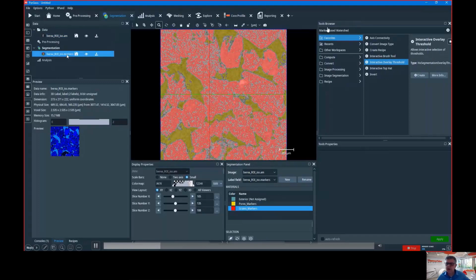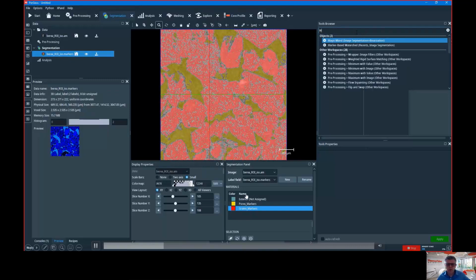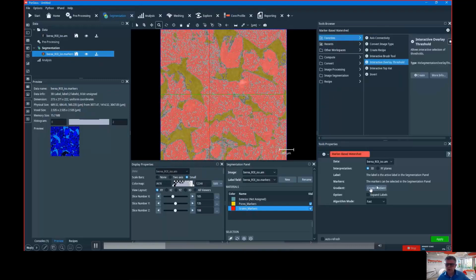And I'm going to search for the watershed module here. Again, it's not a tool in the editor. It's a module that does computation. Similarly, create gradient, apply, and since I'm not inside the segmentation editor, I see the data getting created. I always see my data. When I push here, I got the gradient. I have the markers, and now I will get a new object because I push apply. This module will compute watershed and bring me a new data.